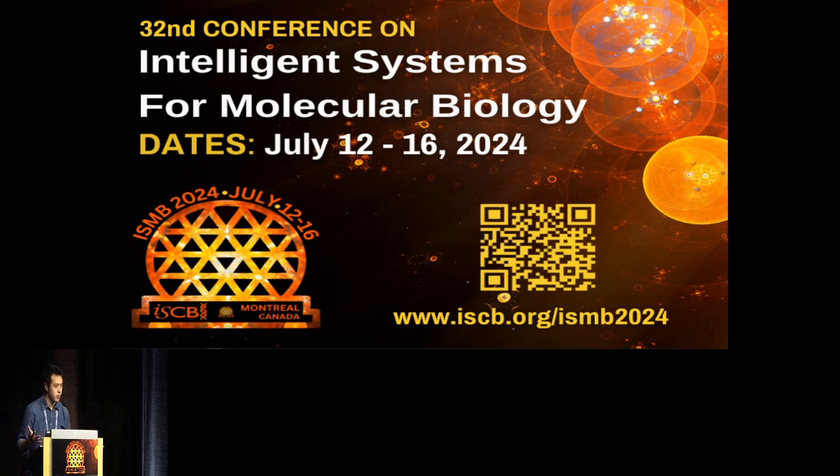But for our project, we're not trying to solve the long read issue, because we use both short read and long read, and with any other data set, you can always combine these two and have different splicing analysis. So for your question, it will find more splice junctions, but I hope everybody uses it and sees how it looks. And I can't answer how GC content is going to affect 3' to 5' bias or coverage, because all these three are going to combine and affect the difference between short and long reads. Thank you.